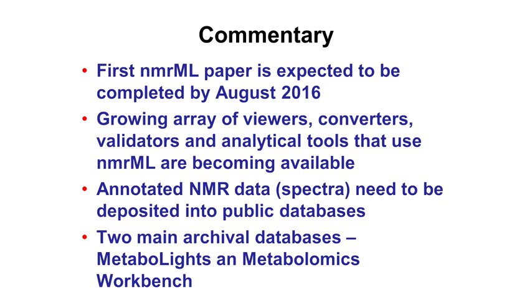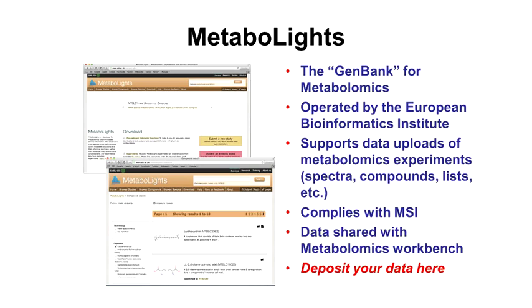We also need the community and people to start contributing NMR-ML formats, so they can deposit it into the public databases, both at the biosample level and at the reference level. Many of those archival databases, which are already accepting or willing to accept NMR format, are MetaboLights and the Metabolomics Workbench. These are the GenBanks, or the PDBs, of metabolomics. So if you publish something, the expectation is that you should put your data into either MetaboLights or the Metabolomics Workbench.